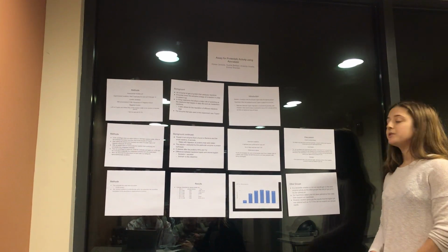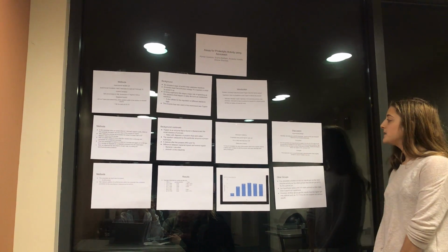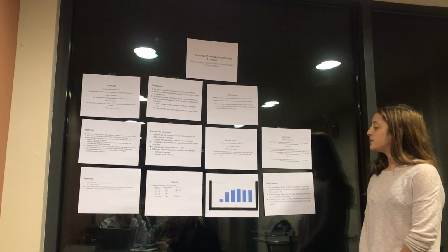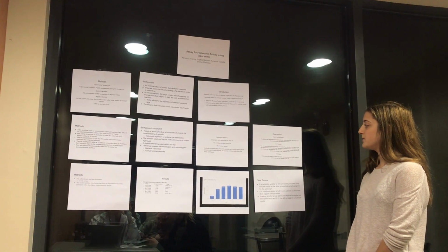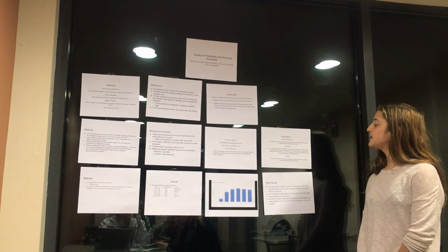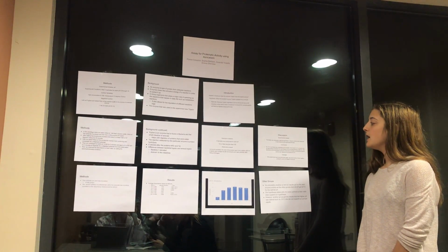The enzyme activity was measured in absorbance by the spectrophotometer. Our conclusion was that yes, the hypothesis was supported by the results. From the pH of 5 to the pH of 8, the absorbance increased and was at its highest peak at pH 8, at the absorbance of 440 nanometers. The absorbance then decreased as the pH went from 9 to 10, proving that the enzyme activity was highest at the neutral pH of 8 as our hypothesis stated.